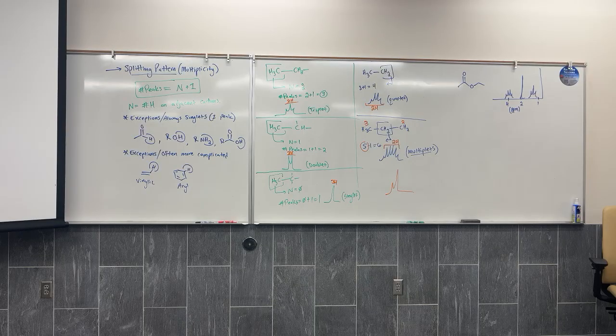So then this will be with the... Okay, so then that, because there's, how many are there? I don't know if you would call this four separate peaks. To me, these just seem like maybe it's hydrogens doing local stuff. I put it on both sides, so actually it's two here as well, two neighbors. Under splitting patterns, very nice, either way, very organized.